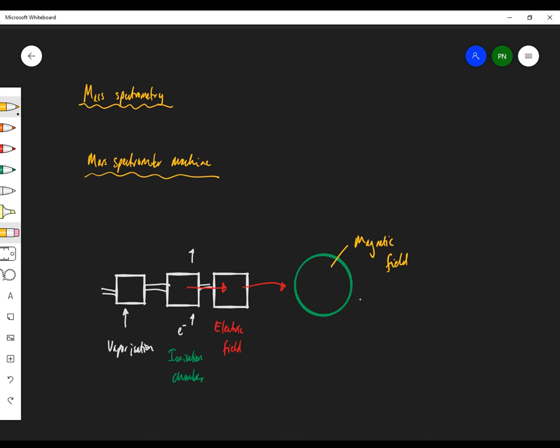And the ions come along. Let me do my ions. They come along and they're bent in the magnetic field. They're bent and forced to land on some sort of recorder. Because they're charged, they create a tiny, tiny current. So these are the charged ions being bent.